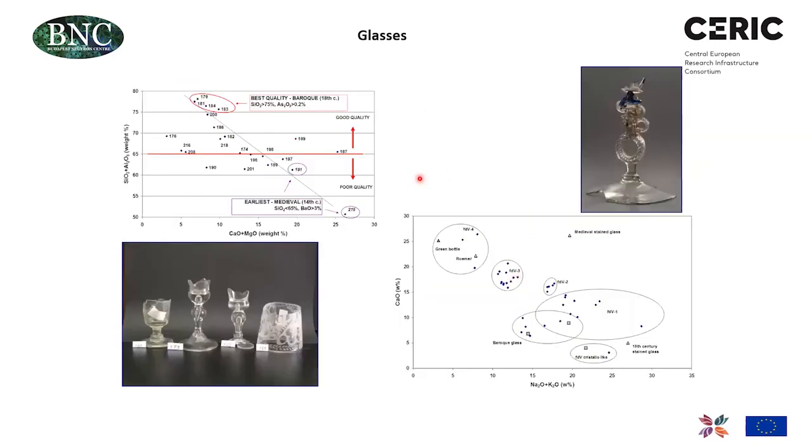So this is the glass business I was already mentioning. There is a clear trend between different manufacturing workshops. So these many workshops had their own recipes to prepare the glass, and even major component composition like calcium, sodium, or potassium were different significantly enough to create groups and differentiate between different manufacturers.